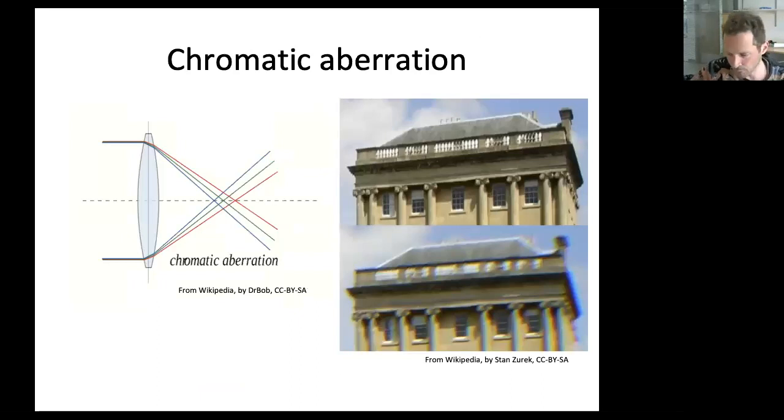Now, before I tell you about the cold FEG, I have to tell you that the objective lens in electron microscopes is not very good in terms of chromatic aberration. So chromatic aberration, as you may know, is the property of a lens that different wavelengths of the incoming light are focused in different planes. And here's just an example from optical microscopy, but the same happens in an electron microscope. And that means if the incoming electron beam that we use to image our samples with contains multiple different wavelengths, or it has a certain energy spread, then you get different defoci for the different energies in the image, and that leads to a fall of information at high spatial frequencies, just as you can already kind of appreciate from this example image here.